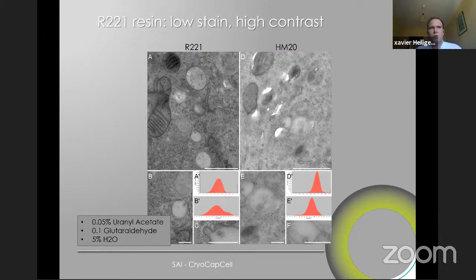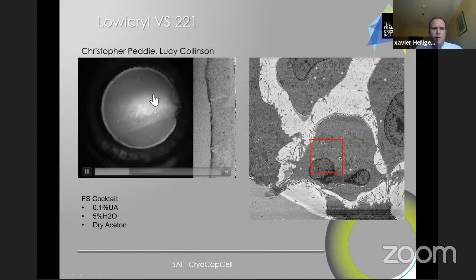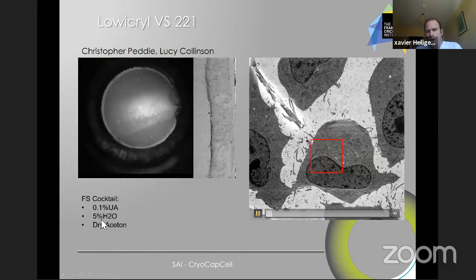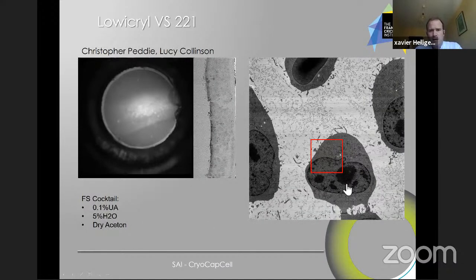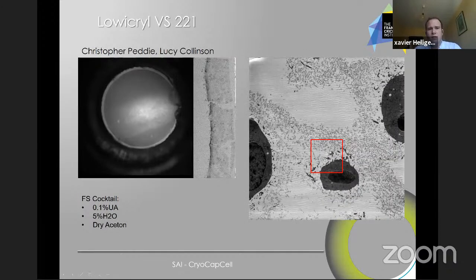So we have already a higher contrast, but can we do block face imaging, which is a critical question. And so here what we can see is a comparison. This is the block surface, which is observed by scanning electron microscopy in serial block face imaging. That's why you see things dancing. And this was done with Lowicryl HM20, the widely known resin. Here on the second video, this is exactly the same freeze sub conditions, so a bit higher amount of UA, no fixatives, 5% of water. And this is the kind of contrast you can obtain from our same sample block.